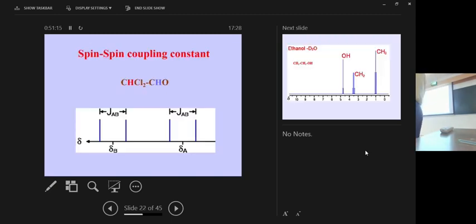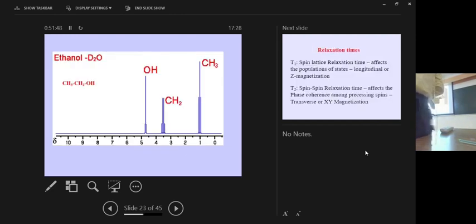Now, that is so much for the chemical shift. The next parameter is the coupling constant. All the protons, as I said, are nuclear magnets, and they will also interact with each other. Just as the nuclear magnets interact with the external field, they will also interact with each other. This interaction results in a splitting, so that instead of one line for each of these two protons, we get two lines here. Because of one coupling, this coupling from here to here results in a splitting of these lines. This is called the coupling constant, and this will be the same in both places.